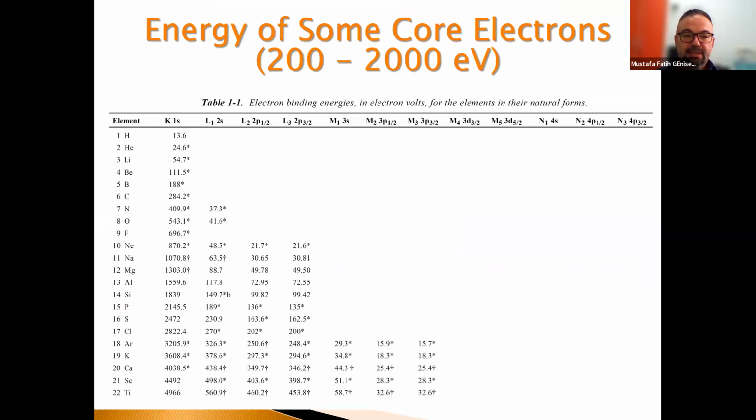When we look at the tabulated data, these soft X-rays between 200 and 2000 eV interact with the low Z materials. As you see, the hard X-ray region starts from 5000 eV. So after titanium, you can make the characterization. If your element has a lower atomic number than titanium, you cannot do X-ray absorption in a hard X-ray absorption spectroscopy beamline.